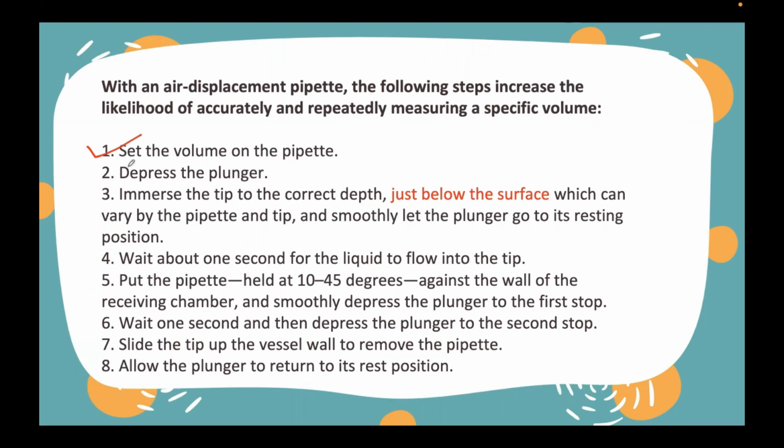You have to depress the plunger. Next, i-immerse mo na siya. Okay, una, isa-set mo muna yung volume. Pangalawa, ipe-press mo or ide-depress mo yung plunger sa first stop. Sa first stop lang ha.